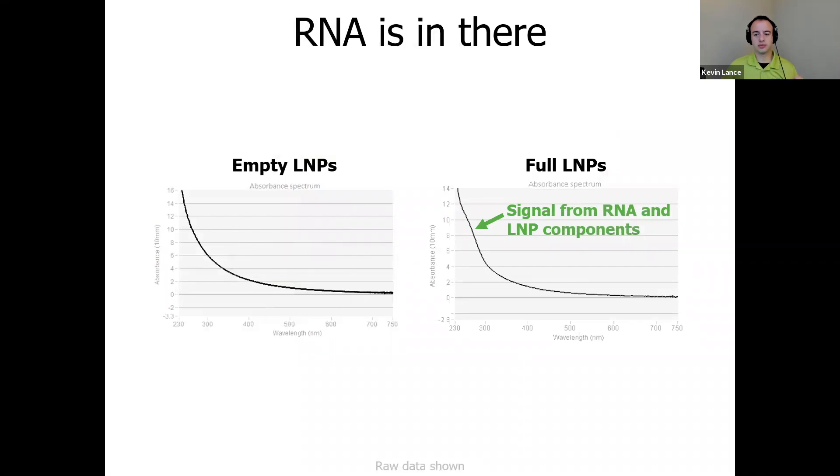If we are trying to deal with all that turbidity, it can make quantifying with traditional UV-Vis almost impossible, but total RNA quant by UV-Vis is normally a big challenge on other instruments and not on Stunner. So for example, if we squint at the full curve shown on the right, we can see the RNA bump at about 260 nanometers, but the difference is pretty small when we're comparing the empty curve and the full curve. So to analyze this, we have to separate out the turbidity signal from the LNP absorbance due to RNA and other LNP components.